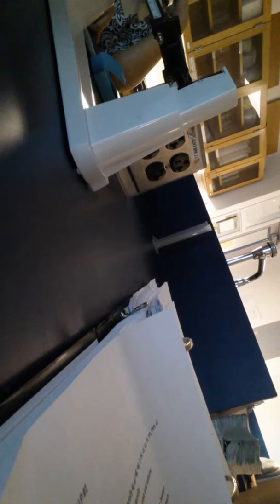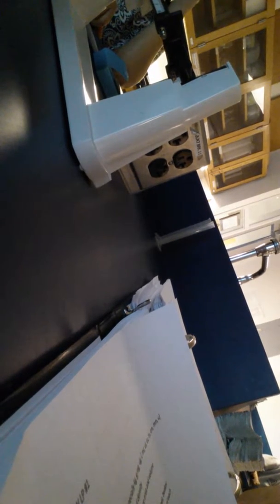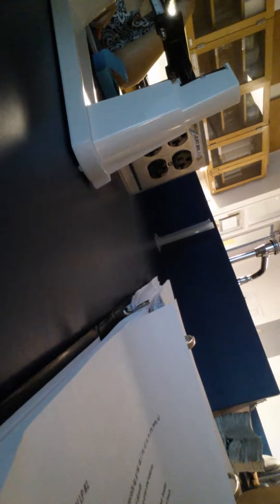The second bullet I have is describe the proper conditions for returning it. That's this. You better know them. How do you determine total magnification of the microscope? You multiply the eyepiece or ocular times the objective lens. So if you have a 10 power ocular and a 40 power objective, the overall magnification is 400.